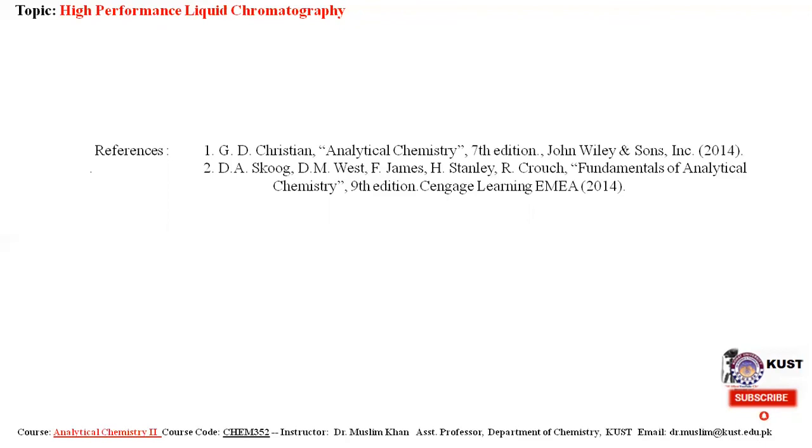This was all about HPLC, not in very much detail; that will be in our next semester or so. But hopefully we will discuss gas chromatography in detail next time.